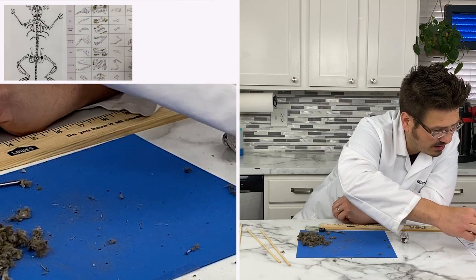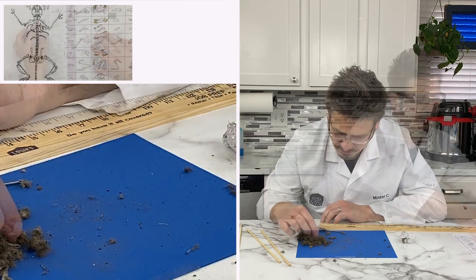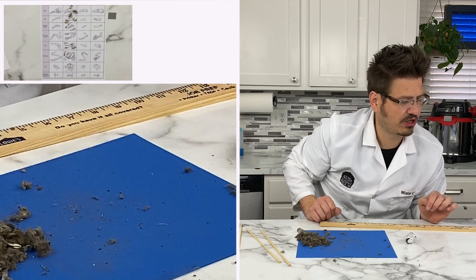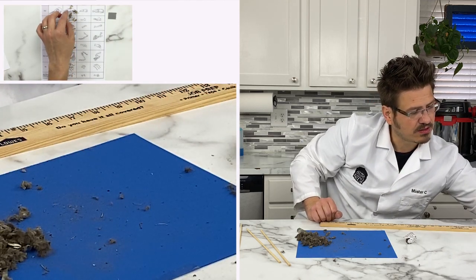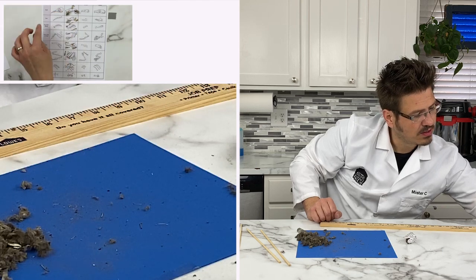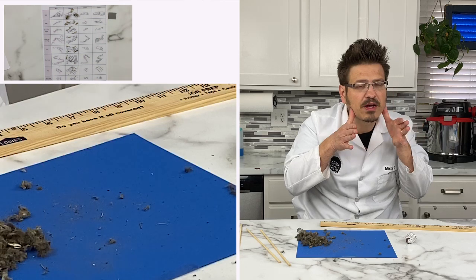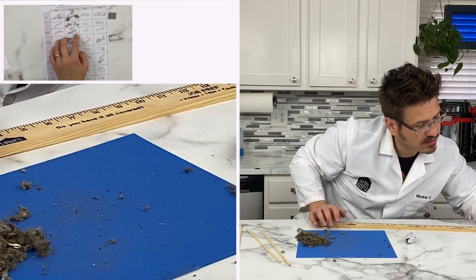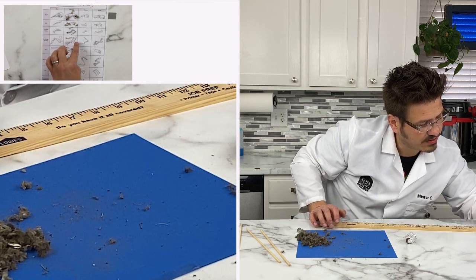We've got, I think this would be another backbone. All right. So there is our selection of bones. We've got our skulls. We ended up with two skulls. Those are so cool. We've got four jaws. So two pairs each. We've got some shoulder blades. We've got some front leg parts.